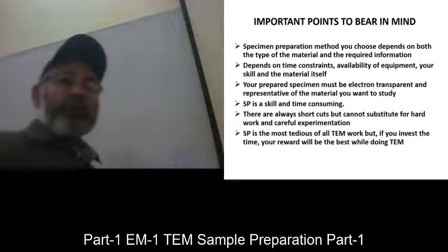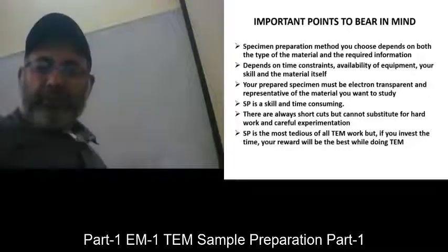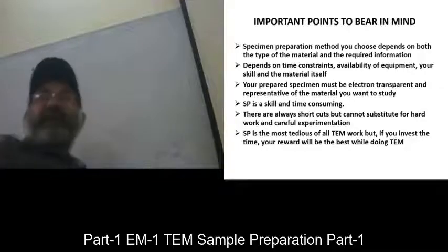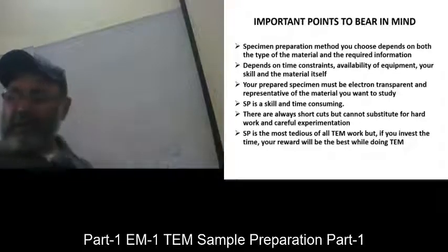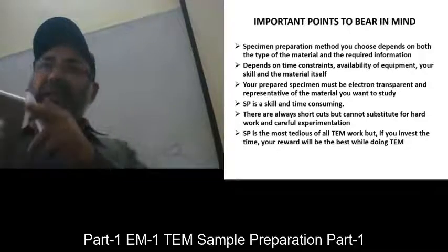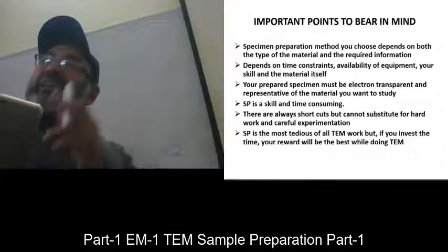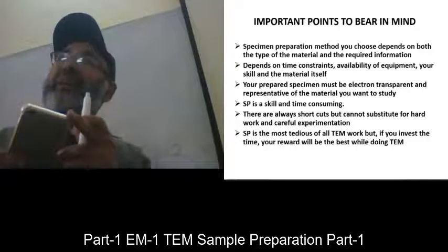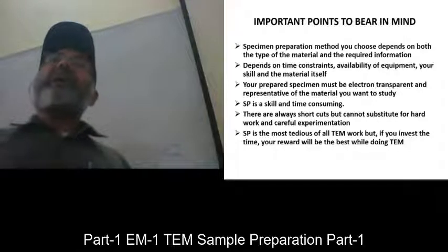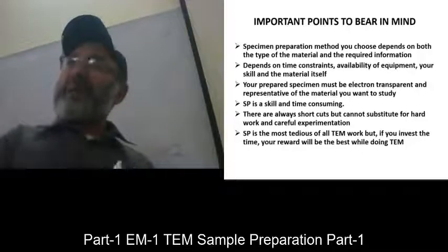And it will become more useful if this crystal you are interested in occurs here at the edge, which is not covered by the glass. Right? If I break this sample and there is a break here, there is possibility that some of the crystal edges will be out of the glass. So people usually select the edges which are more out of the glassy overlapping.